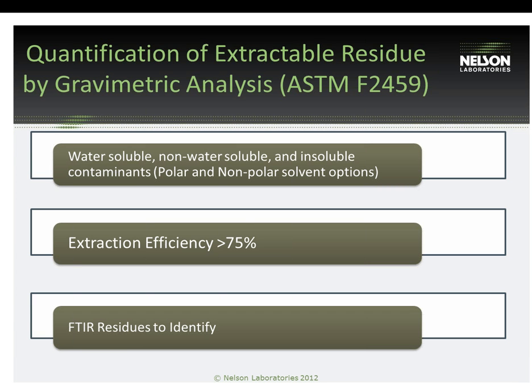The second method being the exhaustive extraction method. With this method, we usually see an uncleaned or a dirty sample sent in where we do repetitive extractions until that final extraction is less than 10% of the original extraction or below our limit of detection. And with that exhaustive extraction, we're able to get a percentage of the extraction efficiency.